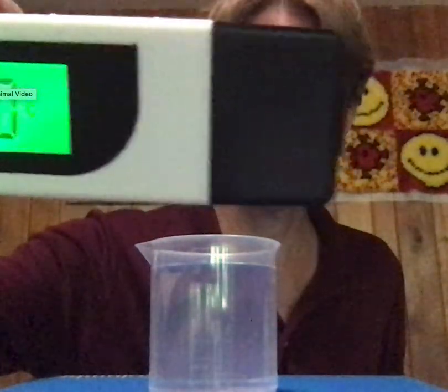Each time before I start part of the experiment, I'm going to record the temperature. That means turning it on and pressing the mode button twice until I get to degrees Celsius.